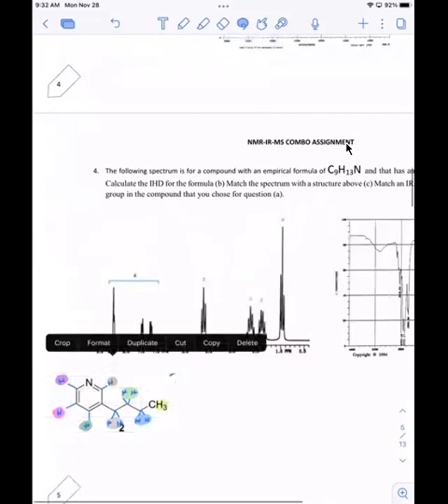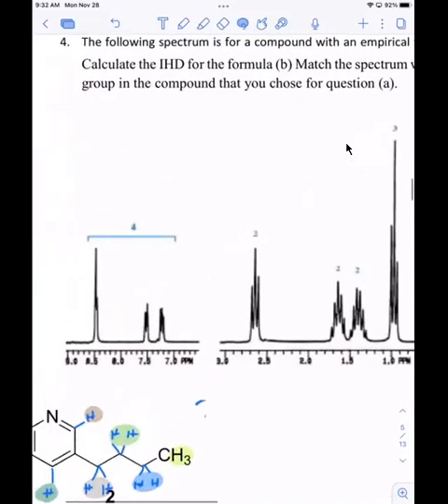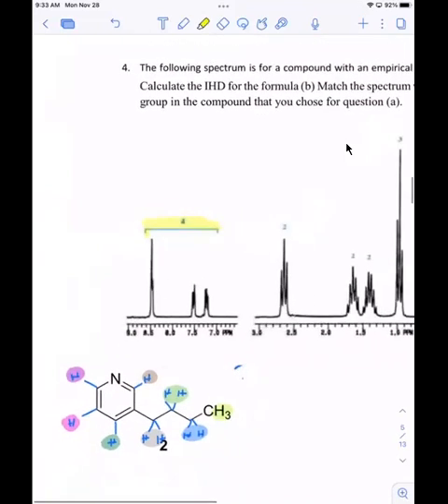Right? So we got a bunch of signals here. And if you look in the aromatic section, which is again between 7 and 8.5, notice the integration down here is 4 protons. And if you look on the ring, I'm not going to go through the details because aromatic protons are kind of tricky. I'd rather spend time working through the examples that we can understand as opposed to working through the aromatics, which can be very, very tricky to understand, and they do a lot of weird stuff.